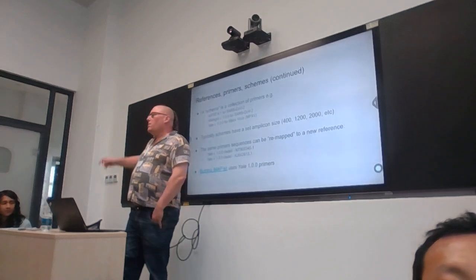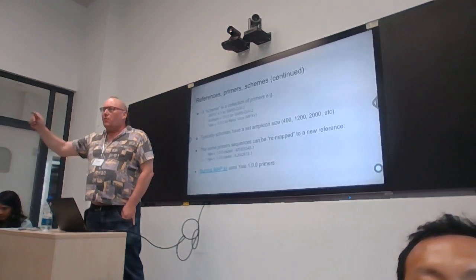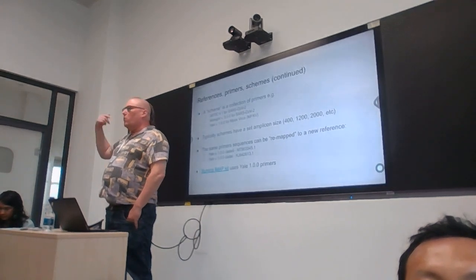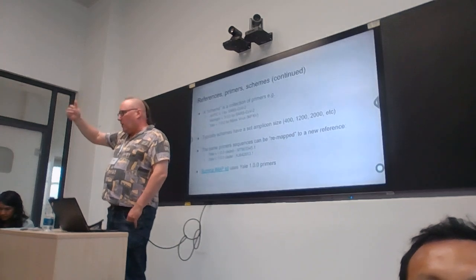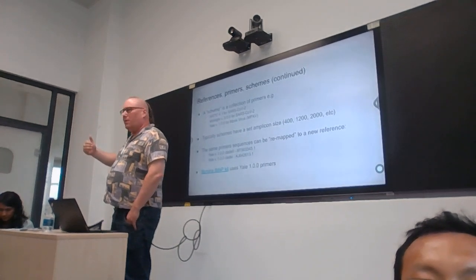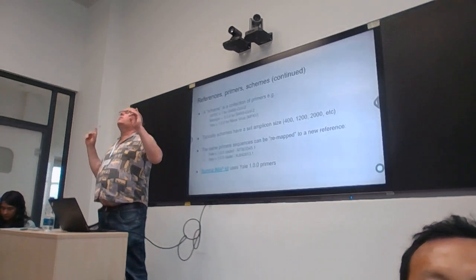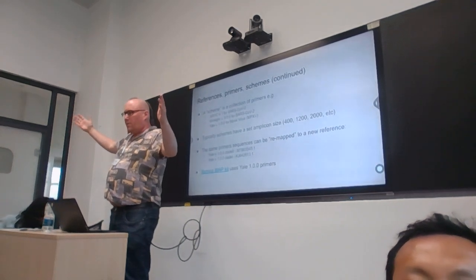Great question. So the question is, does the difference matter? Is it a difference that matters? What we mean by that is we look at where the primers are matching the sequence and we ask, is the virus different in that place? And the answer is that, I can't remember exactly how many primers there are, but there's a few hundred primers.